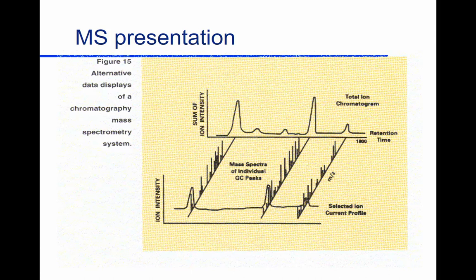You will get a fragmentation pattern in both. You get some fragmentation. I don't know how it compares to others. You'd probably have to weigh in on that because you do LC. Okay. Good, good. That's why we have at least two instructors. So I'm going to look after the LC part, and I'm going to look after here.